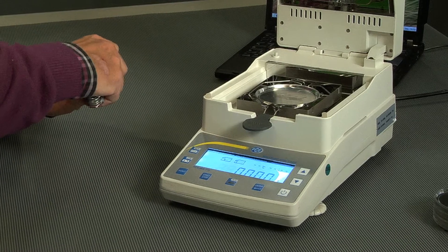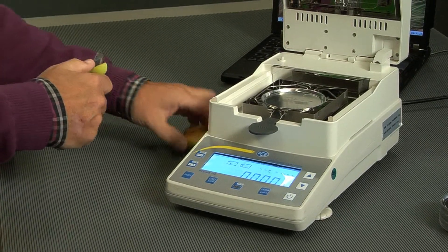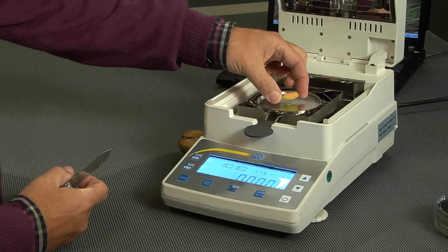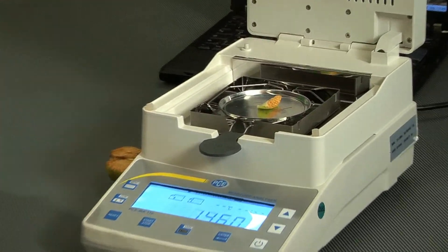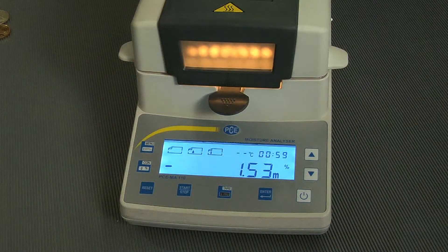We have done it already because it takes a while to do. I've brought here from my apple tree a little piece. When you lay something like this onto here and close the lid, the device shows us what the probe weighs. And now I can start it — we'll have a look at that in the cutting because it takes too long. About 33 minutes with this piece, and I don't want to let you wait that long.